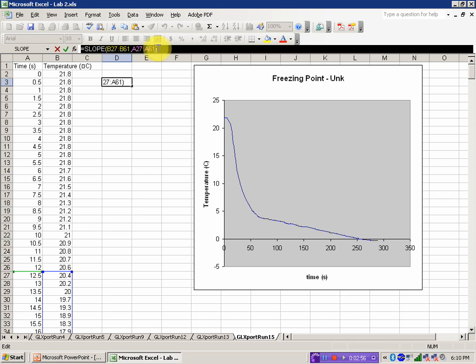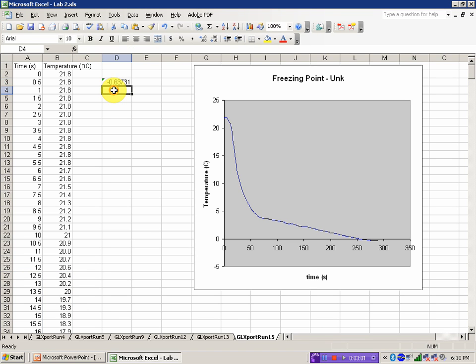I'm going to cheat a little bit. I'm going to copy what's in the cell. So I clicked on the cell and I cursored over the text, red X button, and change the name from slope to intercept. This is an easy way to make sure you get the same range. I'm going to move these over actually, select the two of them, put the cursor on the box around them, move them over one, and label this slope 1 and intercept 1. And that's going to be that top region.